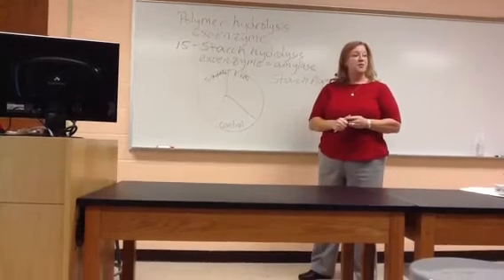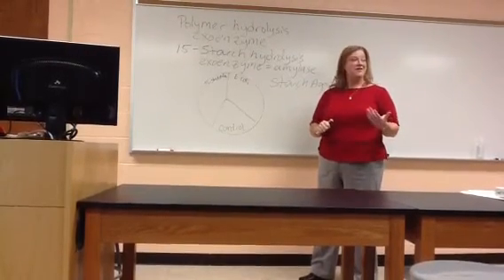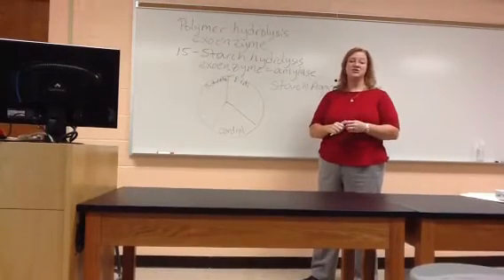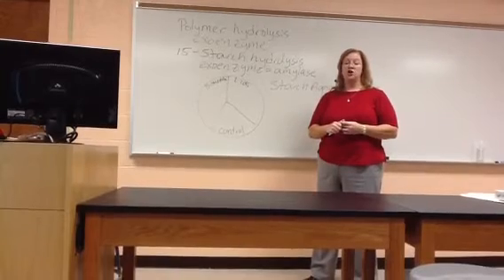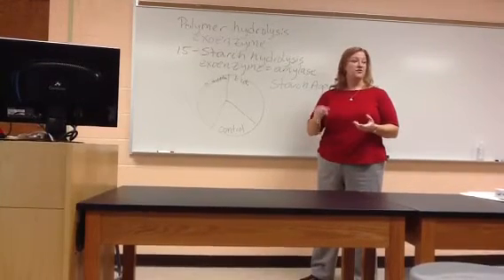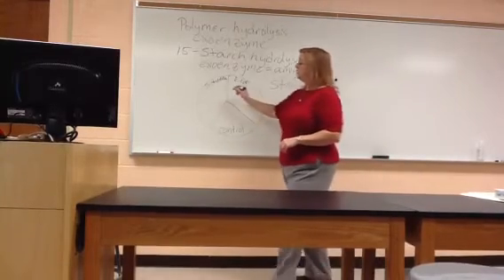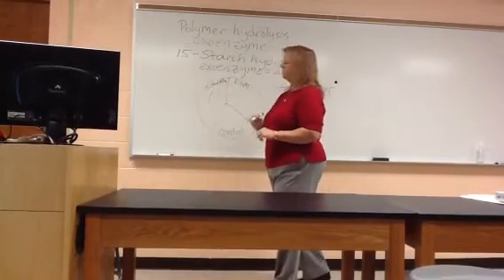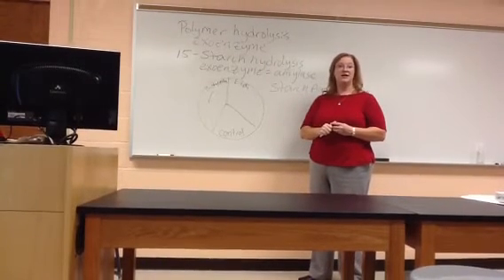We're not streaking this plate, though. We're not trying to get isolated colonies. You're going to use your aseptic technique, flame your loop, flame the openings of your stock culture there on the front table. This time your stock cultures are on slants. They're not broths, so you're scraping up the bacteria that are growing on the slant. And then you're just going to draw one small straight line in the Bacillus subtilis section. Again, we're not trying to get isolated colonies.